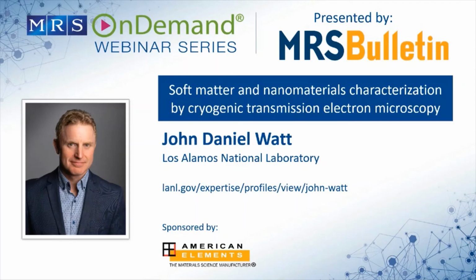There is the idea that maybe you could let the holder warm up passively and you could look for some change, but you have a lot of drift in the TEM when that's happening. So what I think is really exciting is, if we can start to control at these lower temperatures, say minus 100 C, can we do that in the TEM? And if anybody has any idea how to do that, or a holder, then I'm very willing to hear.